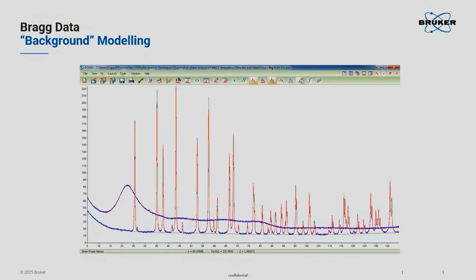So, it's the easiest case. If I have the pure amorphous phase, I can do a measurement of my pure amorphous phase, getting the instrument background. I'm afraid this is hard to see in the back, but maybe you can see here the gray line, which is running here. I hope you can see it, maybe a little bit clearer here. So that's a refined instrument background.